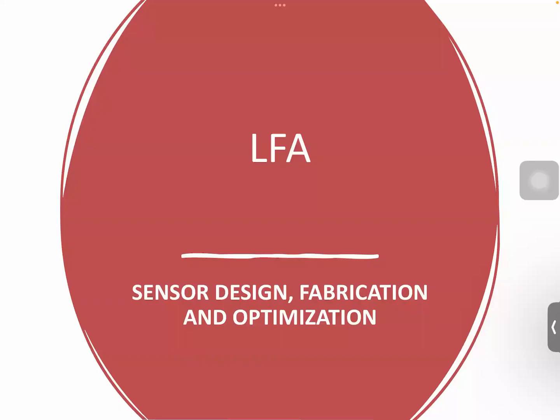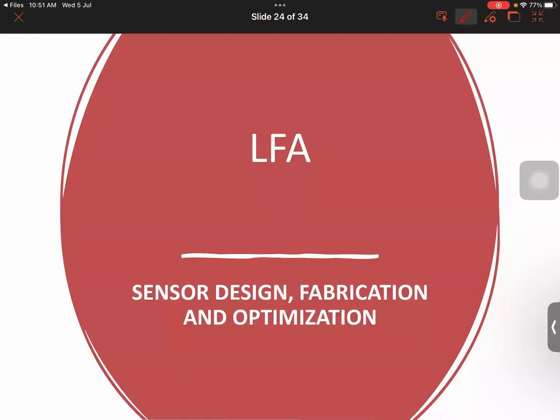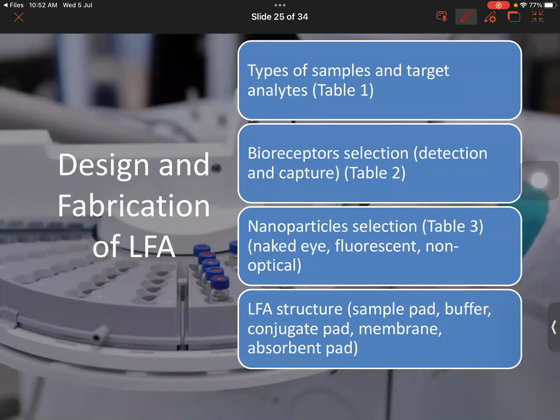Sorry, before that, in part 2 we're going to discuss more detail on the sensor design, fabrication, and some optimization. Of course, before we start part 2, I hope that you can refer to the paper titled Guide to Tutorial Design and Fabrication of Nanoparticle-Based Lateral Flow Immunoassay by Professor Arben Merkoçi. It's a very detailed protocol published in Nature Protocols. Table 1 and all these are referring to that tutorial. I hope that you can refer to this before we discuss the second part.